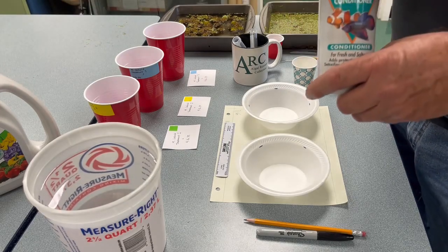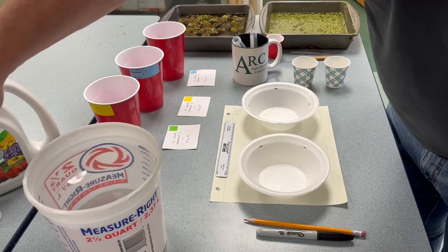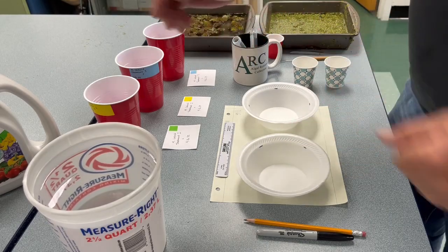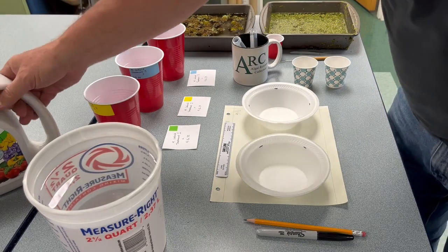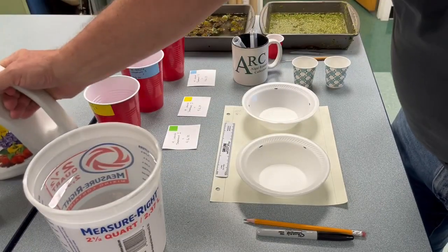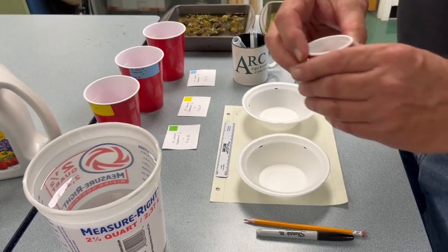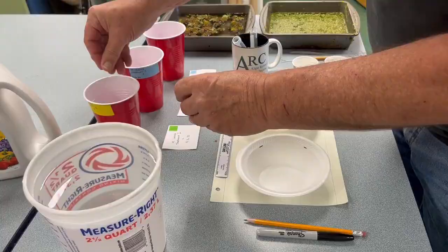One of them is this stuff that you will add to your water source in order to get rid of the chlorine or the chloramine, depending on which city you're in. So we've already done that in here. This is Osmocote, which is a slow release fertilizer that will help keep the plants growing. So I've got the Osmocote in here. It looks like little beads, and I'm gonna put 25 of each of them in each of these cups.